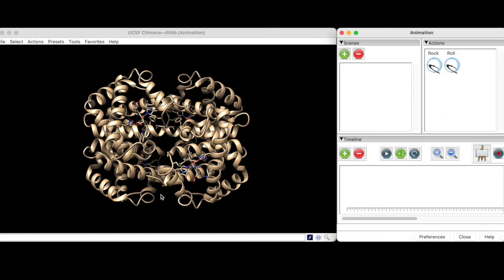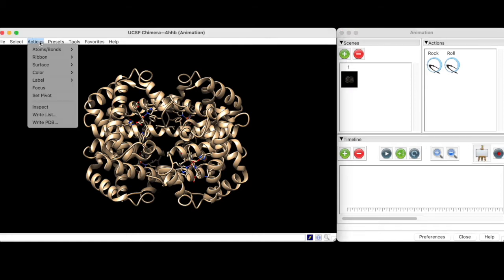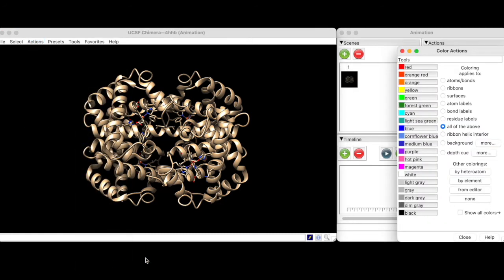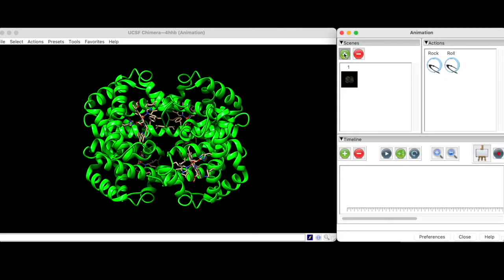To create our first keyframe, we'll take a snapshot of the structure in its default state using the green plus icon. Next, we're going to set up a color change by going to Actions, Color, All Options, and selectively coloring the ribbons green. Now we'll take a snapshot of the result to create the second keyframe.